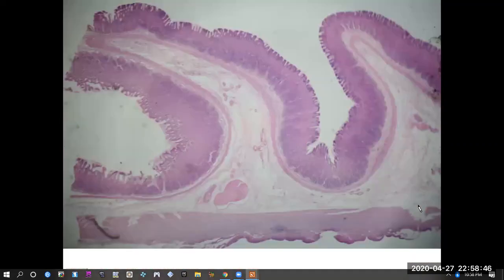So now we're viewing a stomach sample. In the first trait, the ruga. So here we see two large folds. Here's just one ruga that's highlighted. And that's the trait to let us know we're viewing the stomach, the large mounds of the rugae.